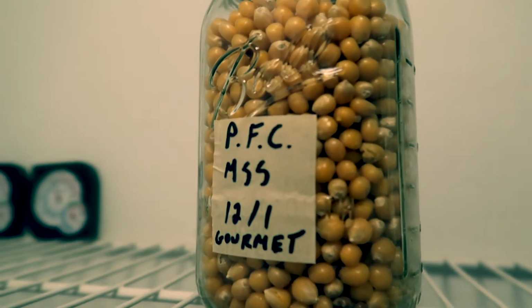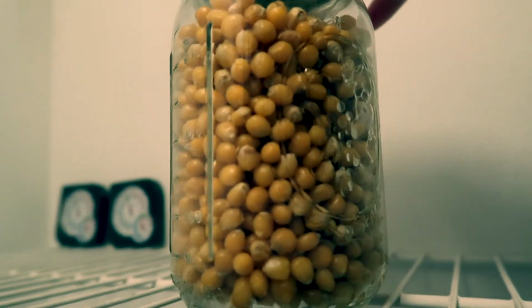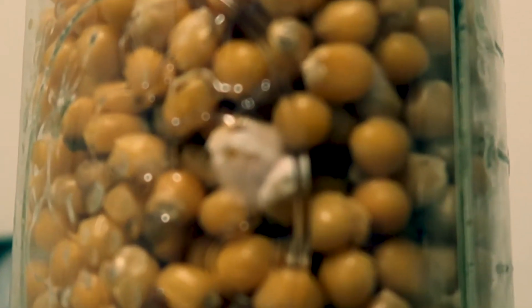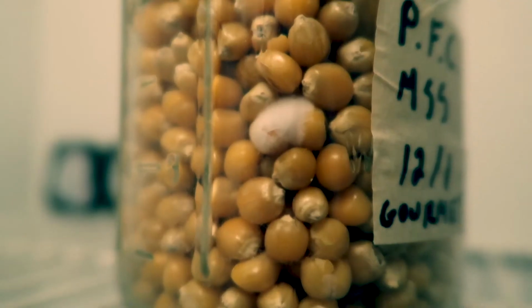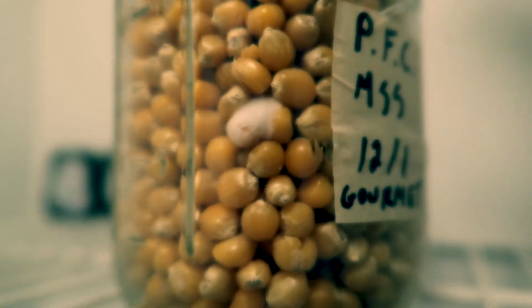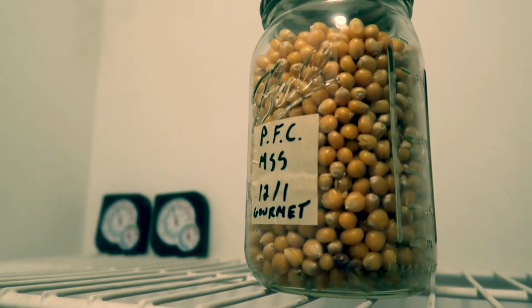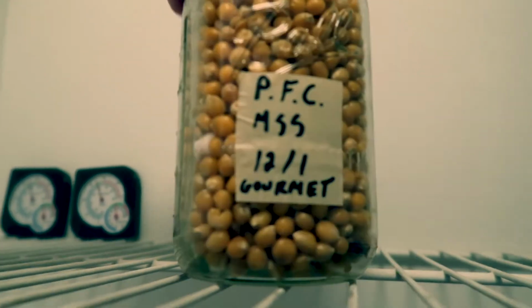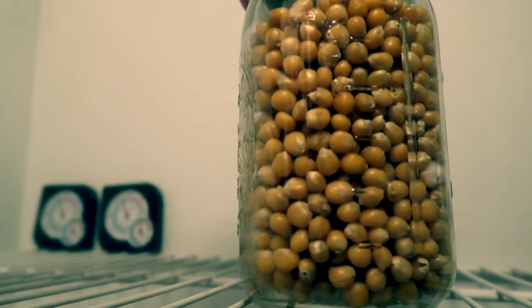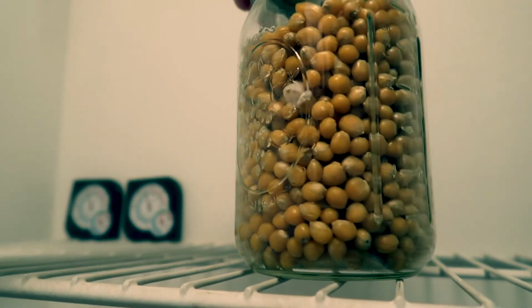Here is our last inoculation method, the multi-spore syringe. Now, within 2 weeks, all we have to show for is a little bit of mycelium right there and a little bit of mycelium right there. Just as we predicted, and just as it's going to be when you inoculate grains like this with a multi-spore syringe. As I explained during the inoculation, the spores need a germination period before they can actually start to connect and grow out to form that mycelium. And 2 to 3 weeks is the average time for spore inoculations to show any growth like this.